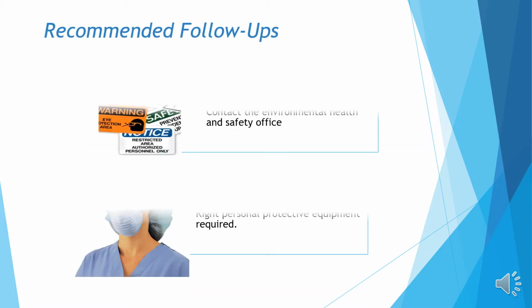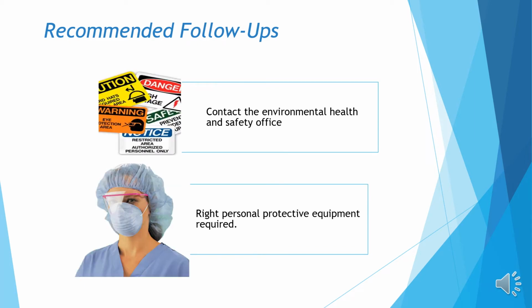Do not downplay the seriousness of potentially hazardous spills. If the spills are life threatening, please contact the Environmental Health and Safety Office first. Please avoid direct contact with such hazardous materials by wearing personal protective equipment, because they spread quickly and are easily absorbed by the skin, and they may damage the tissues.